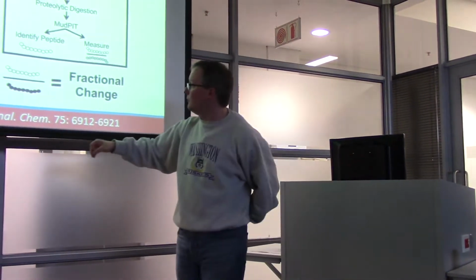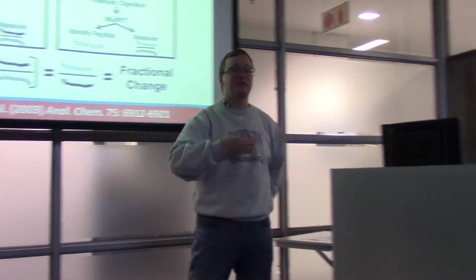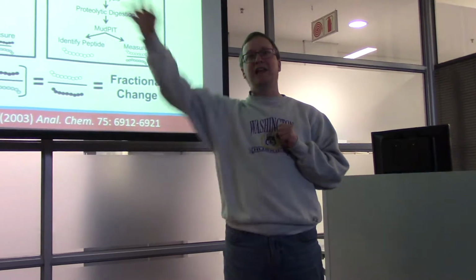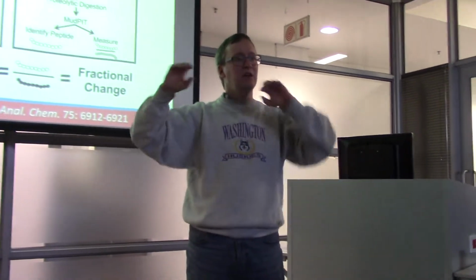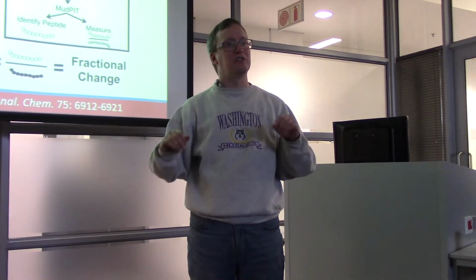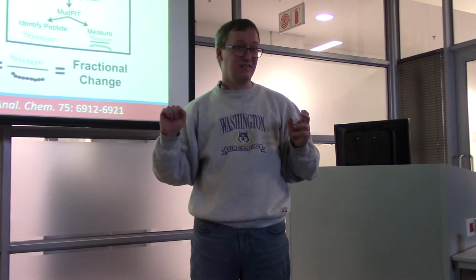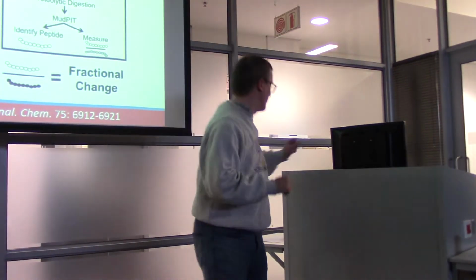And the reason here is that both of these can have this internal standard divided out. Because A gets compared to S and B gets compared to S, we're able to pull S out of that fraction to say, how does A compare to B directly? Do people see the math there? Okay.